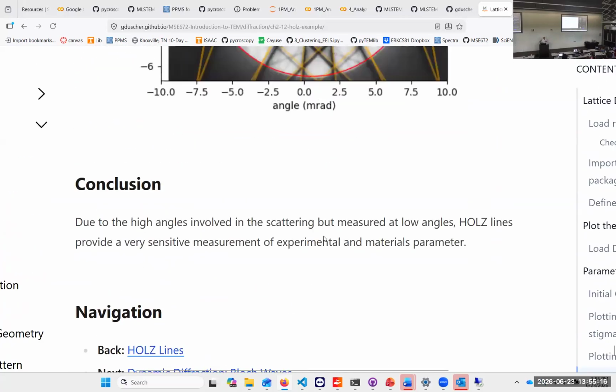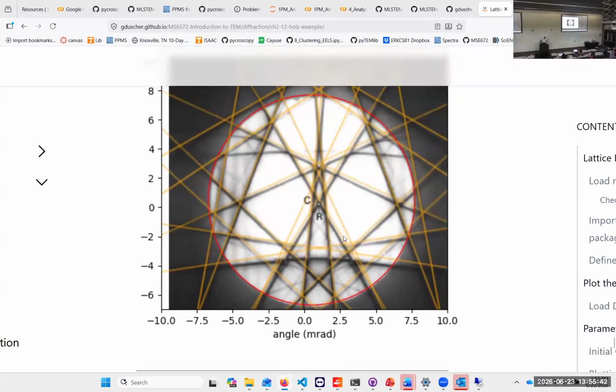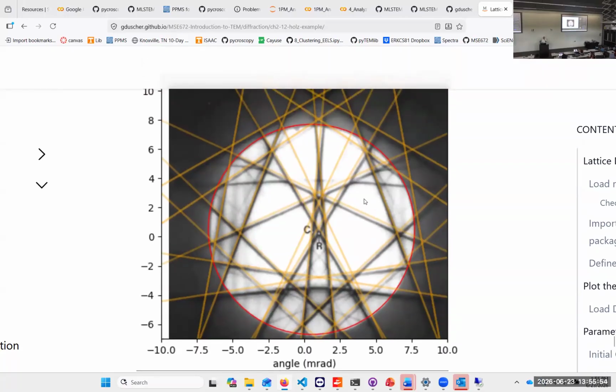Okay, so that is a super sensitive method. So you can measure actually things like, dopant would not work, but certainly alloying works. If you have Vegard's law, right, a small amount of copper and aluminum will be detected on that system. And so if there is any, let's say there's some Cottrell cloud around a dislocation, you can actually see that. You can map the strain field of dislocations with that. All of that stuff is possible and directly accessible to you with this.